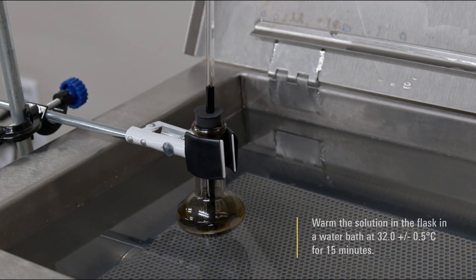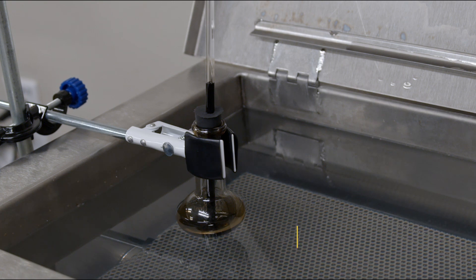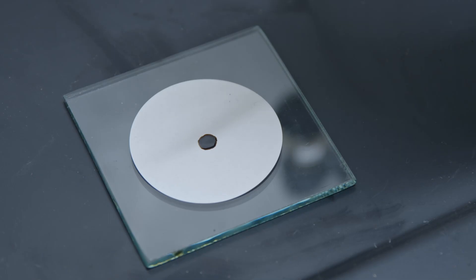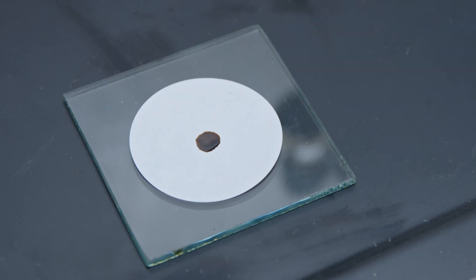Warm the solution in the flask in a water bath at 32.0 plus or minus 0.5 C for 15 minutes. Stir the sample thoroughly, then place a drop of the solution on the filter paper.